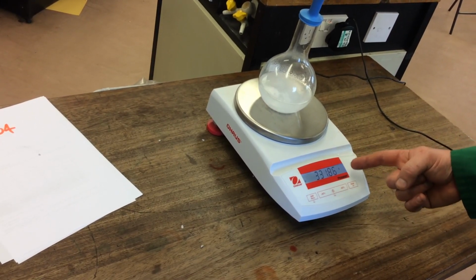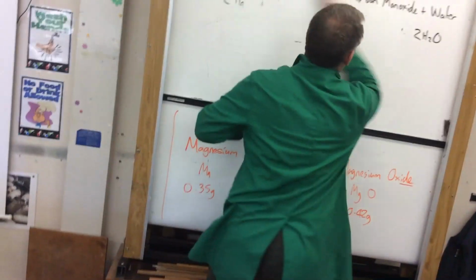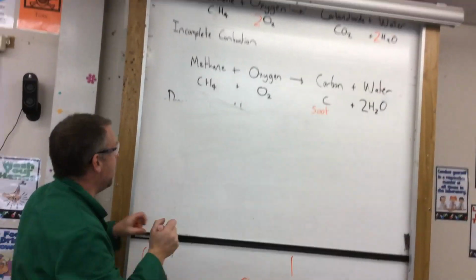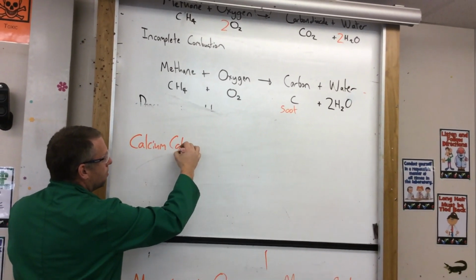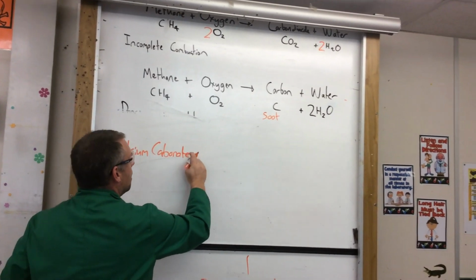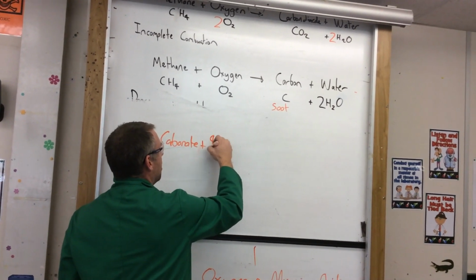So what does that mean? Well, let's go back to the board and have a look at the board, and we'll try and explain it. So let's put this onto here. So in today's reaction we had calcium carbonate plus hydrochloric acid.